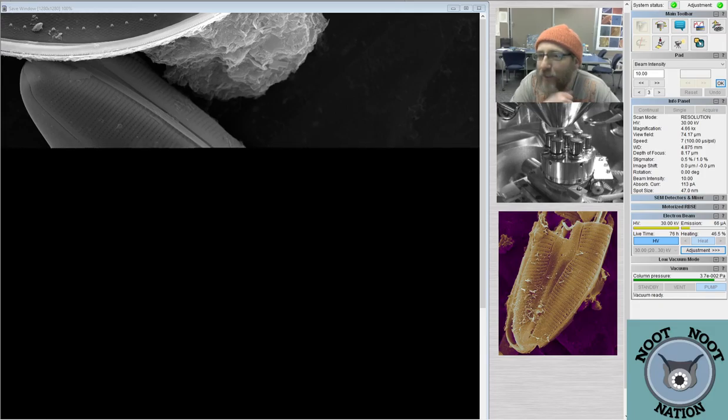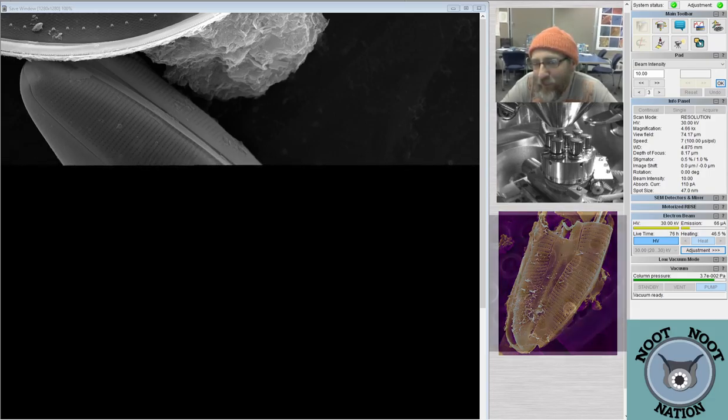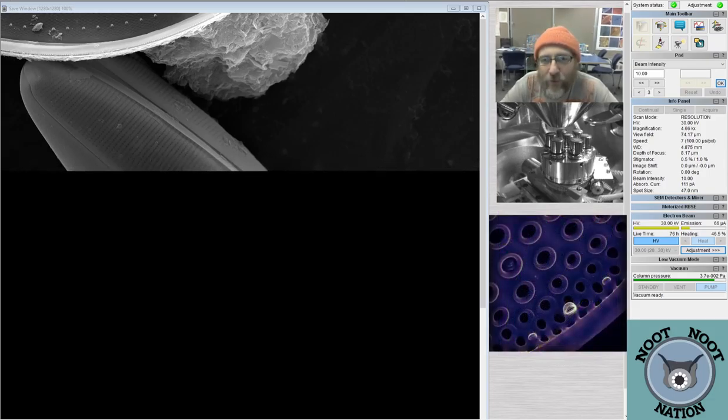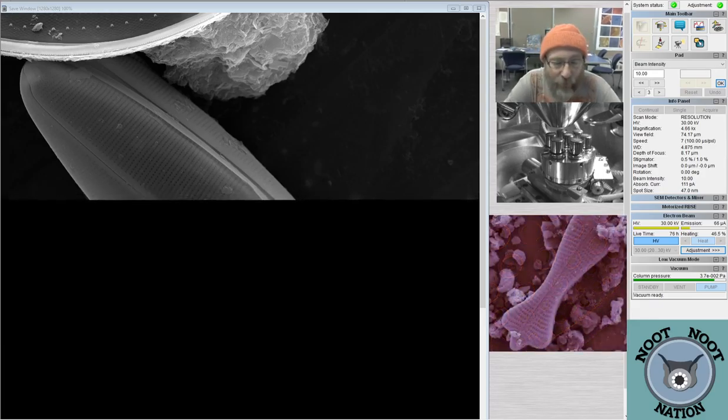It's a semi-ASMR experience. Are these outer cell structures also visible in light microscope in living examples? Yes. So last night I had these same samples on my light microscope. We were looking at the fossil organisms or just their skeletons last night as well.